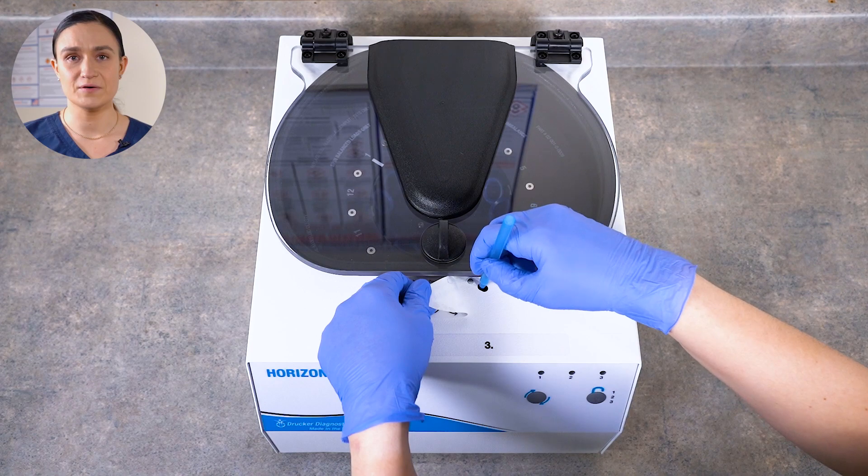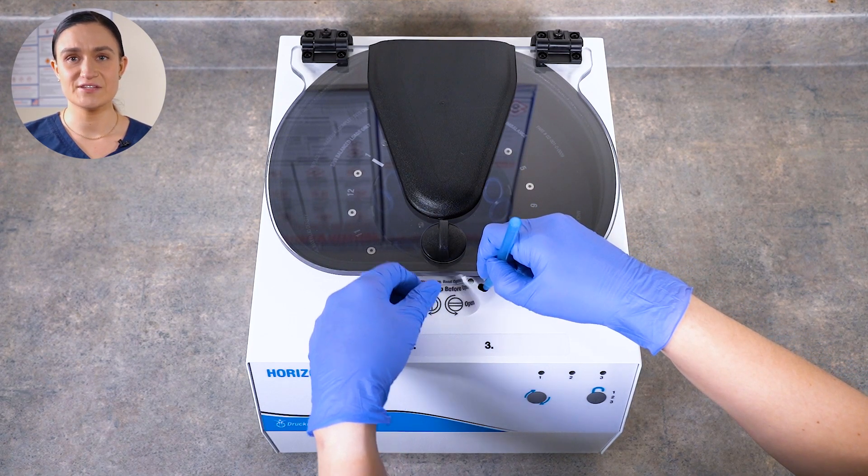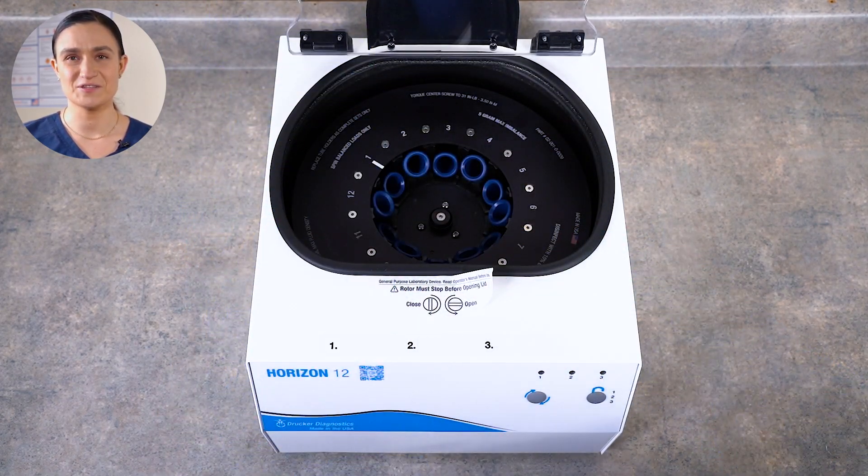Place the top of the pen in the hole and pull forward along the channel. The lock will disengage. Now you can turn the lid latch a quarter turn counterclockwise and access the rotor chamber.